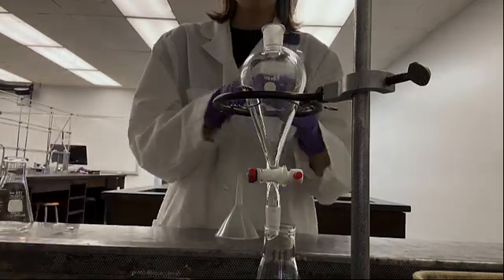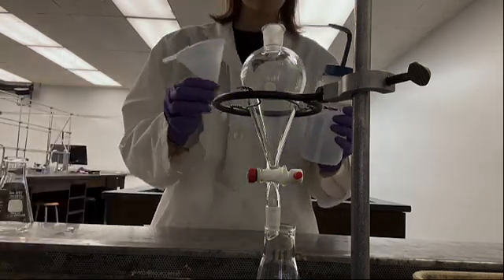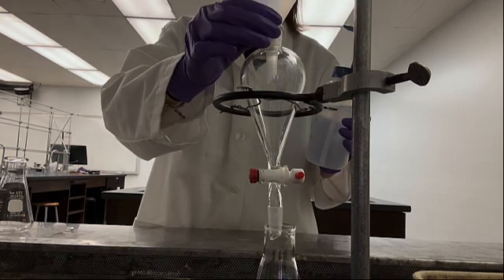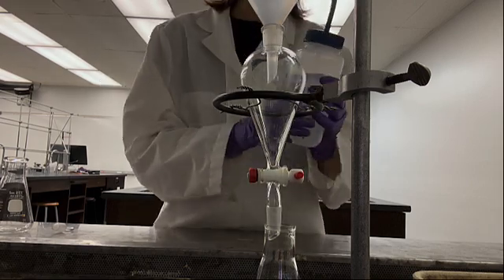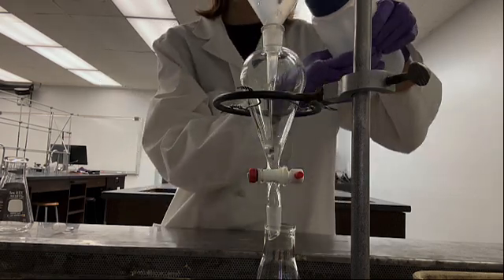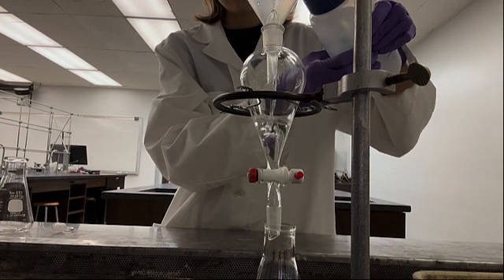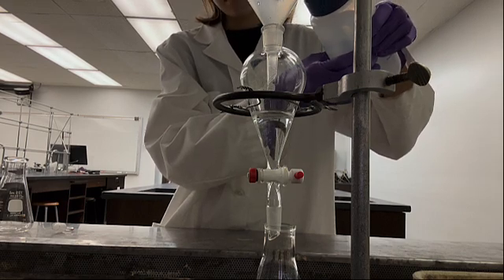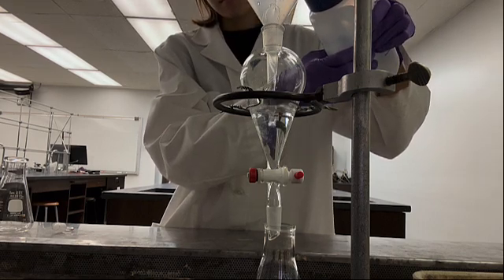Pour the immiscible liquids into the separatory funnel using a plastic funnel. I used a squeeze bottle to directly pour it into the funnel for the tutorial. I tried filling it high enough for you to see the two separate layers once I add in the diethyl ether.